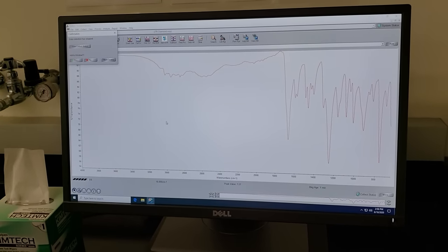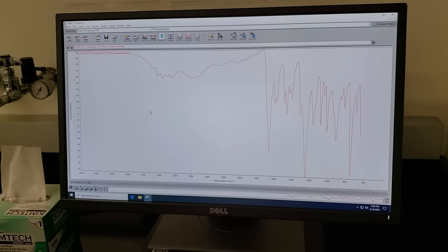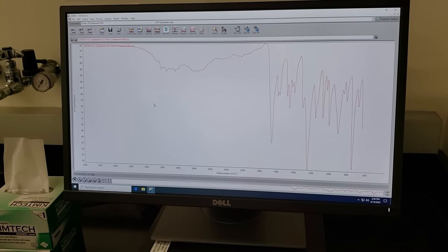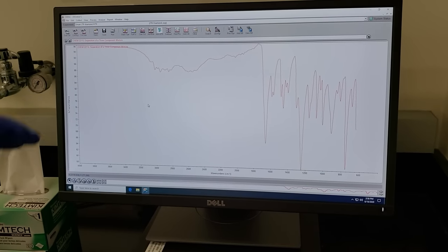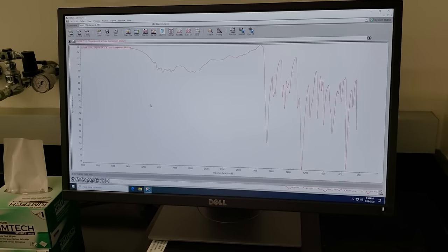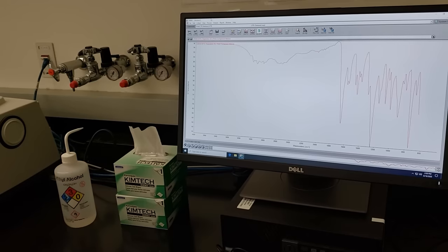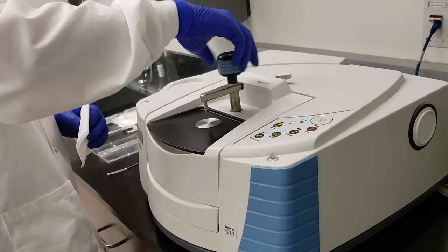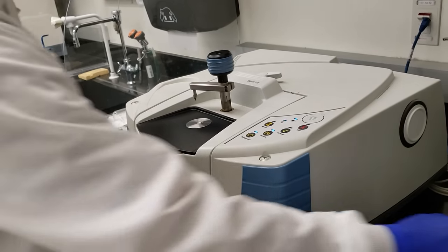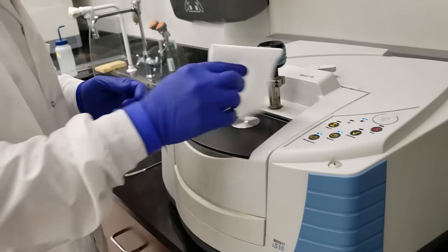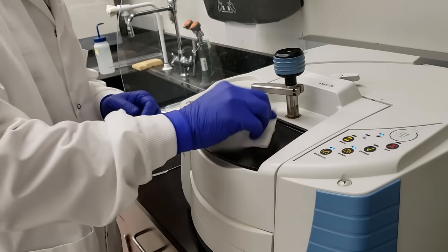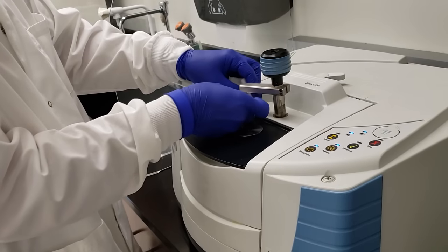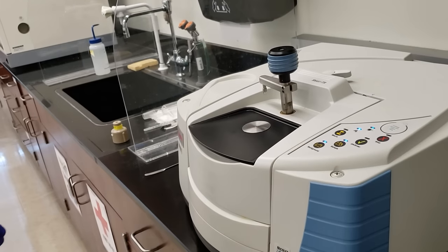We've got our sample set up. We hit OK and begin collecting our spectra. Very quickly, our eight of eight scans are finished. I'm going to add this to window number one so we can see it. This is the spectrum for our acidic component, our acidic unknown. This will be presented to you on ELC along with all of your IRs for all three components. You'll go through and identify the important peaks, indicating what functional groups are present. Once we've finished collecting our spectrum, we need to clean up: undo the press arm, swing it to the side, take a chem wipe dampened with ethanol, and carefully wipe the crystals off the diamond. Always remember to clean the bottom of your press arm as well.